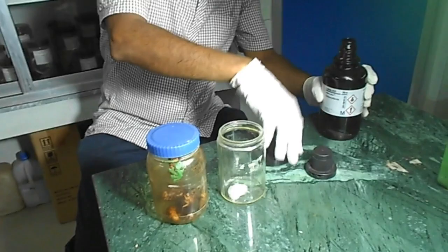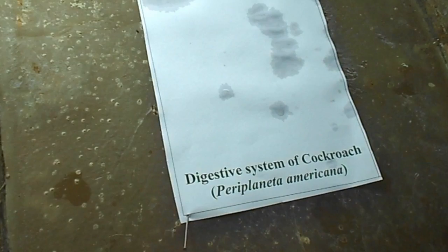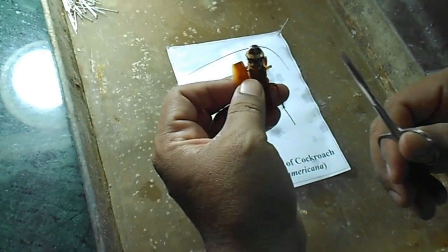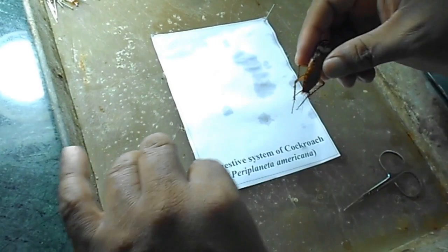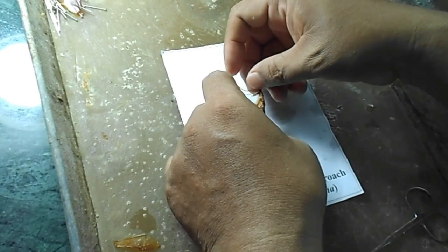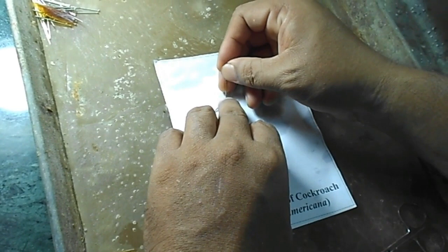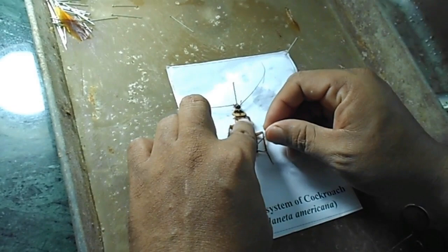He puts four or five cockroaches, as per your requirement, into the glass jar. Now I demonstrate how we can dissect out the digestive system of cockroach. For dissection, you first cut the wings — both wings — though you may choose not to. Then you place the cockroach in the dissecting tray and by the help of an insect pin or ordinary pin, you prick the distal end of the mouth. Similarly, pin the last abdominal part.